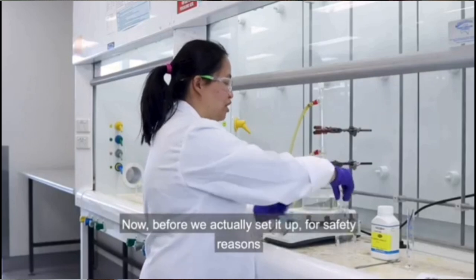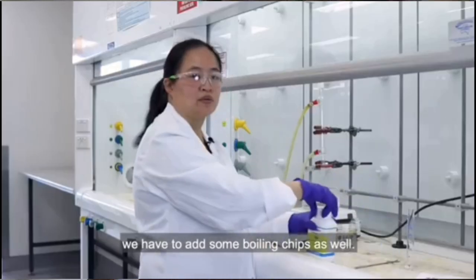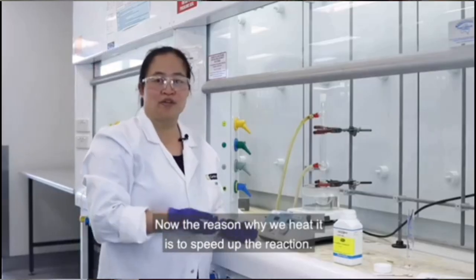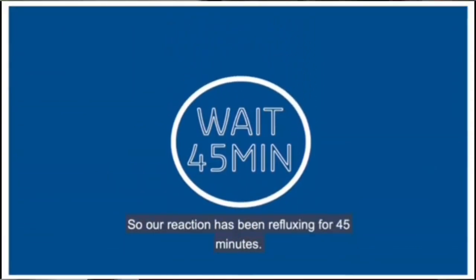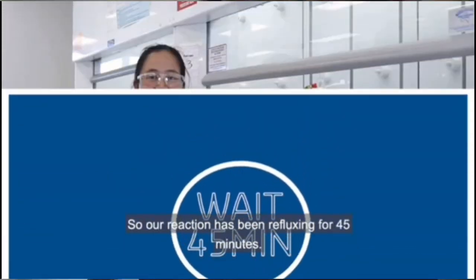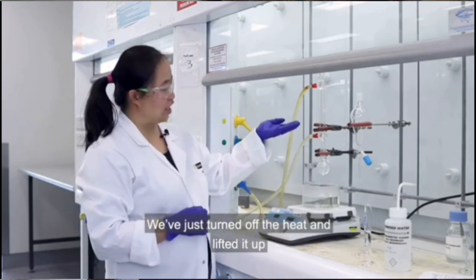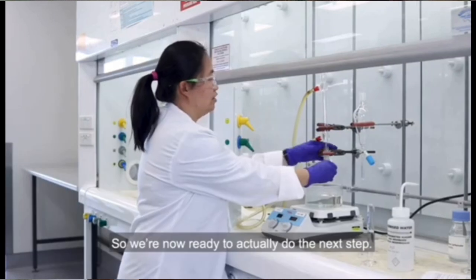Now, before we actually set it up, for safety reasons, we have to add some boiling chips as well. The reason why we heat it is to speed up the reaction. Reaction setup is ready to go. So our reaction has been refluxing for 45 minutes. We've just turned off the heat and lifted it up out of the water bath for it to cool down to actually do the next step.